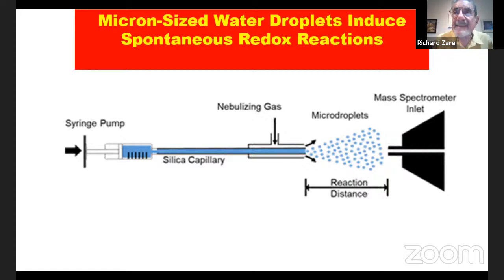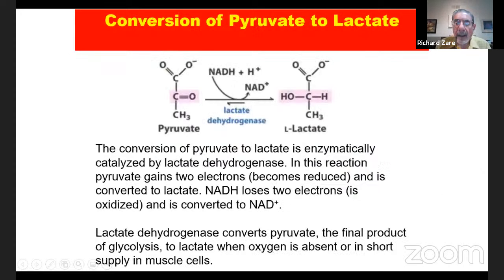Please notice, this is not desorption. This is not electrospray, okay? Electrospray involves using an electric field. There's no electric field being applied to this setup. There is no catalyst being added to the solution. There is no electric field. We're just going to spray droplets. Okay? Now, for some reason, it doesn't go on. Doesn't like to. Aha, here we go.